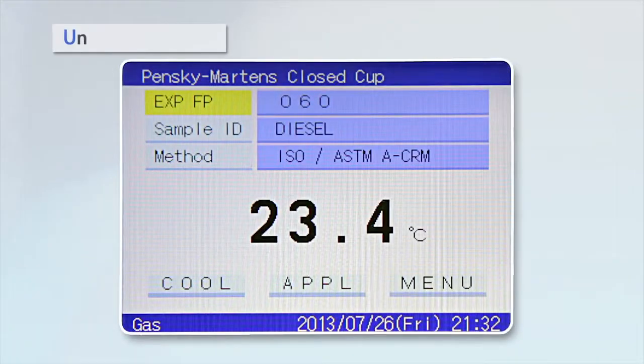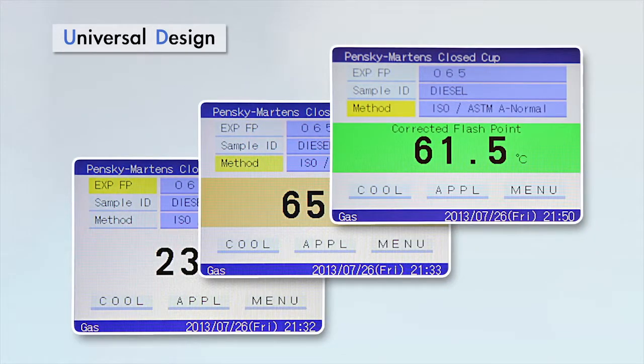For high visibility, an ergonomically color-coordinated display has been adopted. The operator is able to track the current status of the instrument by background color.